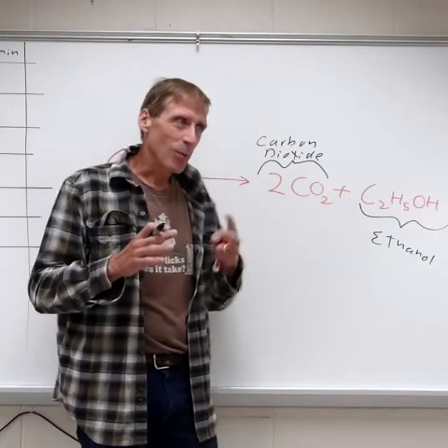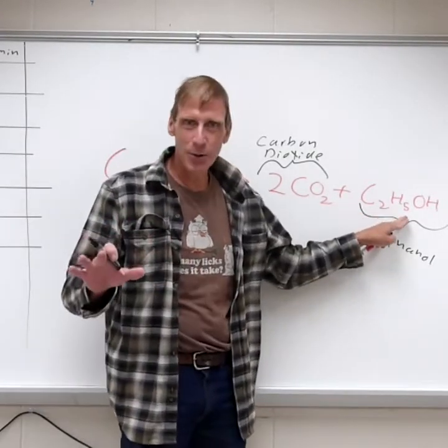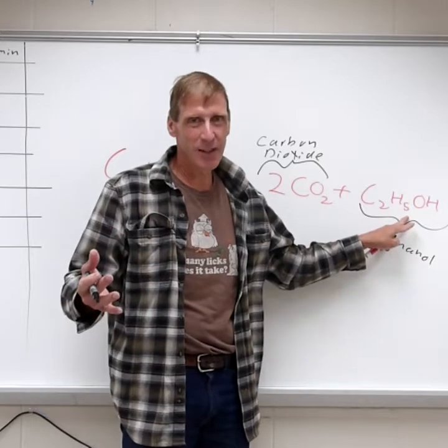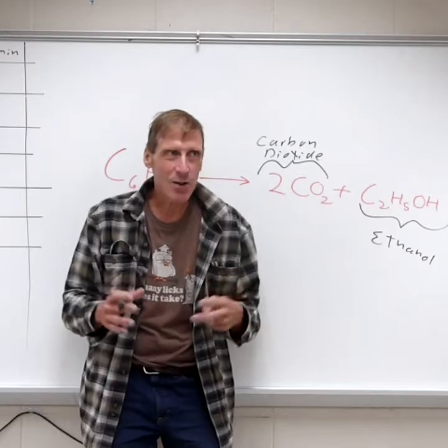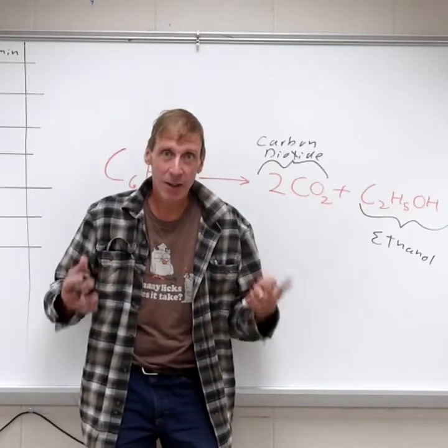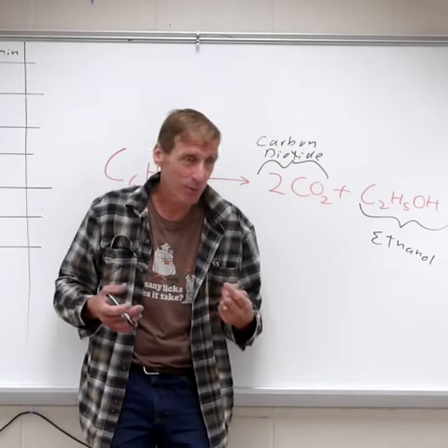So during this experiment, we want to see how much fermentation is occurring. We're not going to measure the ethanol, although you can. It's just technically more difficult. We're going to actually use CO2 production to get an indication of how much fermentation occurred and how much energy was converted by these yeast into a usable form.